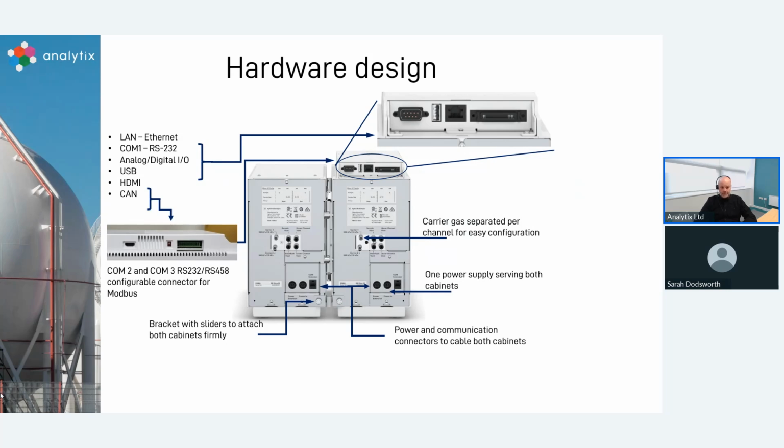Then we've got the power supply, as I said, a 12 volt connection in the back, and that powers both of the chassis if you have 2 of them within there. But essentially still a very, very compact platform, very, very simple, easy to set up. We essentially need carrier gas supply at 5.5 bar and then power, and then obviously your sample connecting up from there.